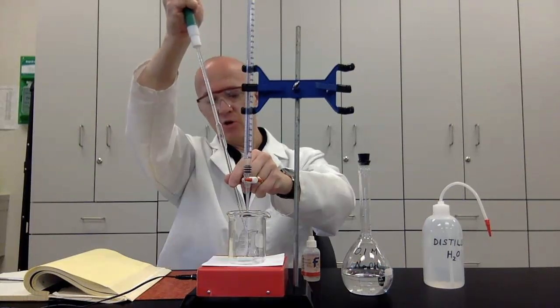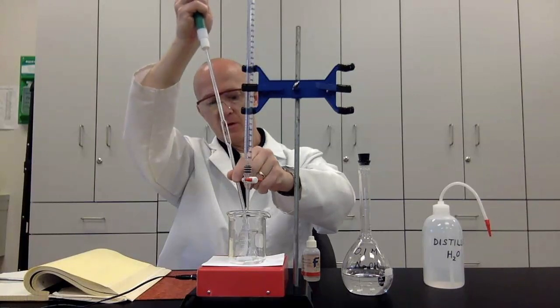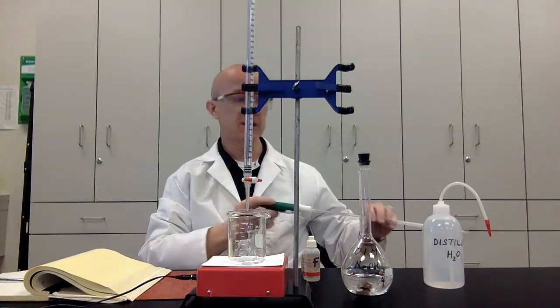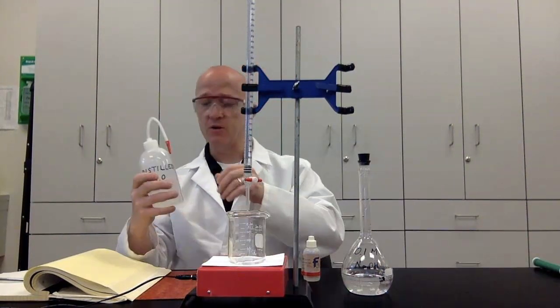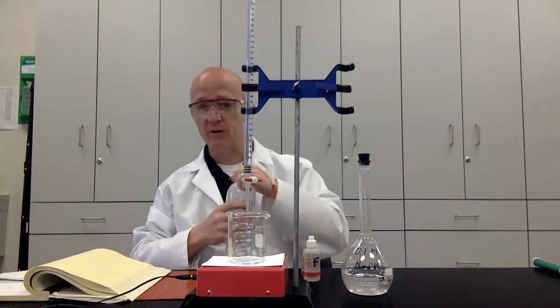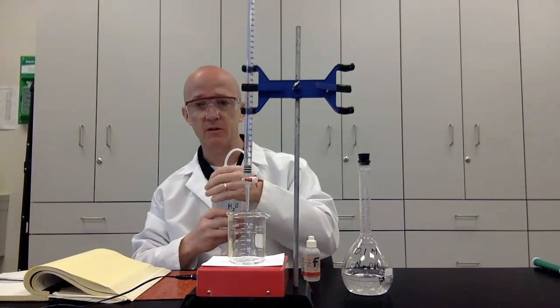Now I'm putting this known volume into my beaker. I'm going to have a certain amount of moles of acetic acid in that beaker. You get that? I'm going to put some distilled water in with this so that I can actually see the volume a little easier. 5 milliliters isn't a whole lot to see when it comes to a beaker like this.